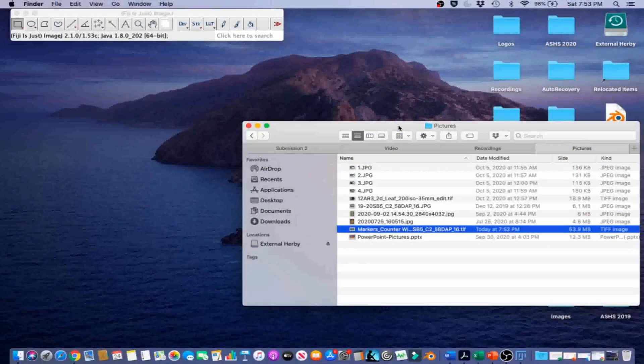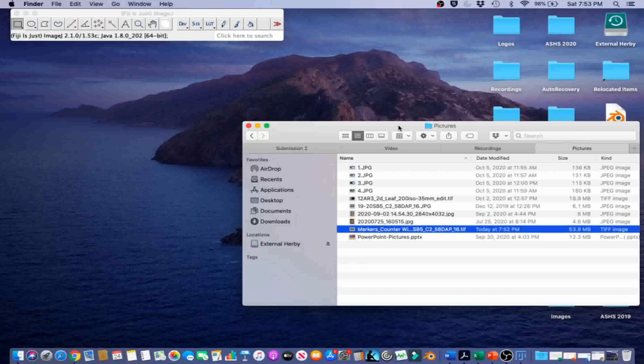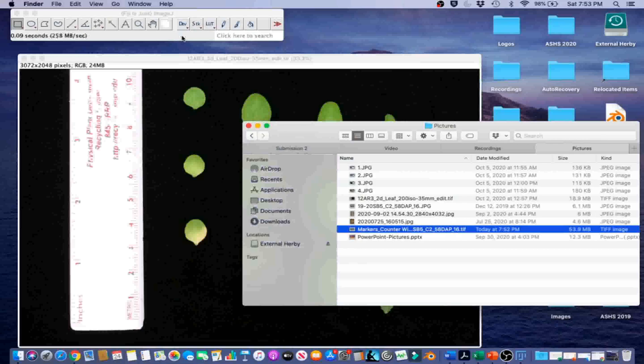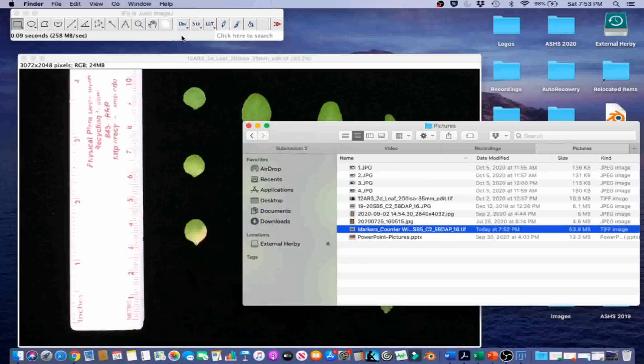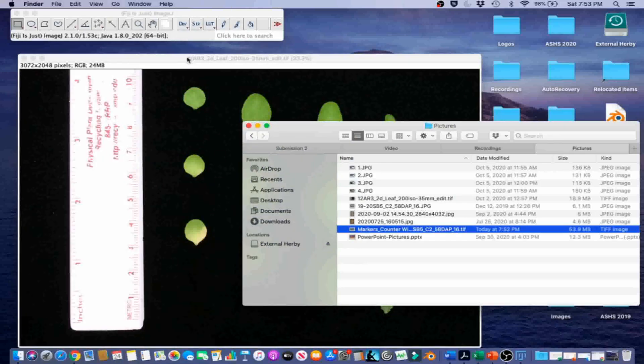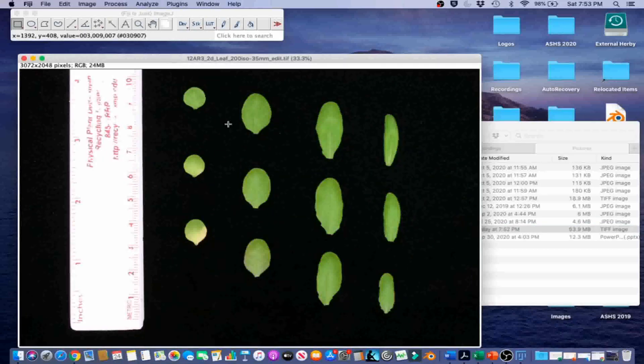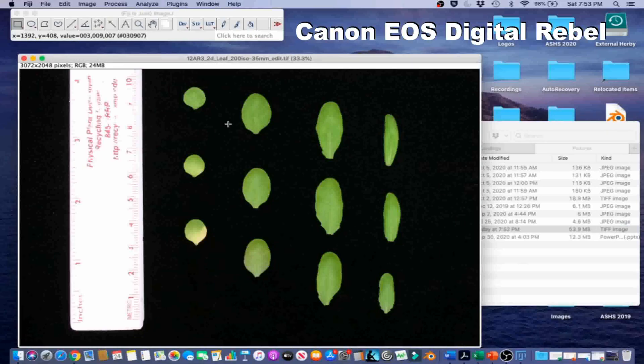For this example, we will automatically count the number of leaves and the area of each leaf for a scanned image of Arabidopsis leaves. First, let's open the image by dragging the image onto the graphical user interface. This picture was taken with indoor lighting using a Canon EOS digital DSLR.